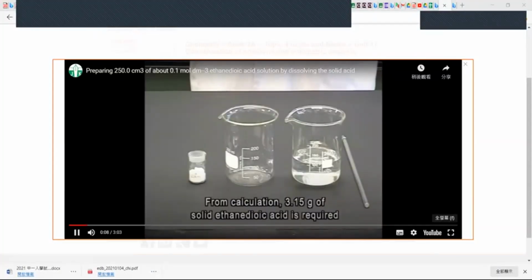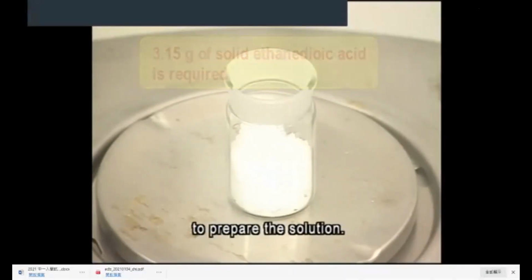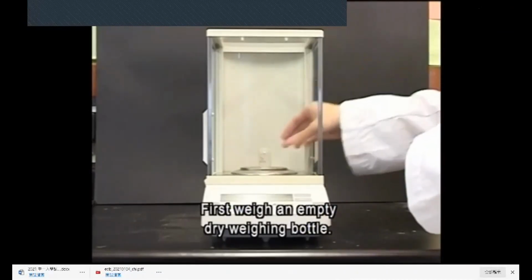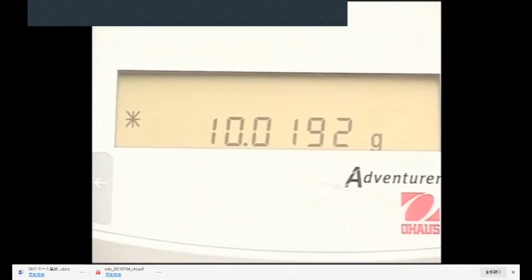From calculation, 3.15 grams of solid ethane dioic acid is required to prepare the solution. First, weigh an empty dry weighing bottle. The mass is 10.0192 grams.